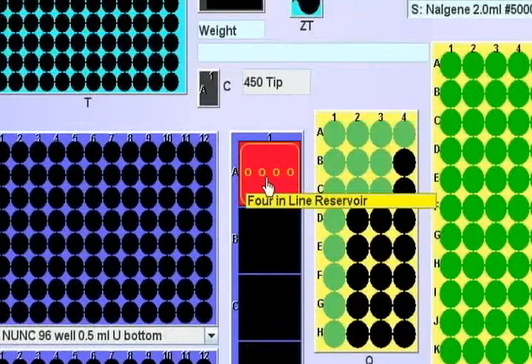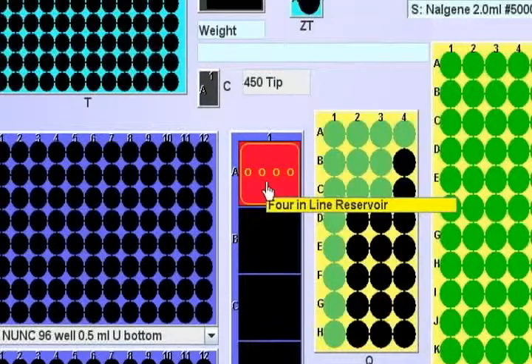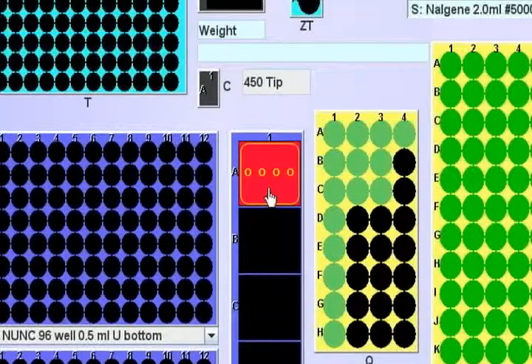The formatter will access the first vial until it receives an insufficient volume signal. It will then automatically seek volume from the next vial. Insufficient volume on the last vial is a fatal error requiring operator attention. Right-clicking the RA1 symbol will reset it to the first vial.